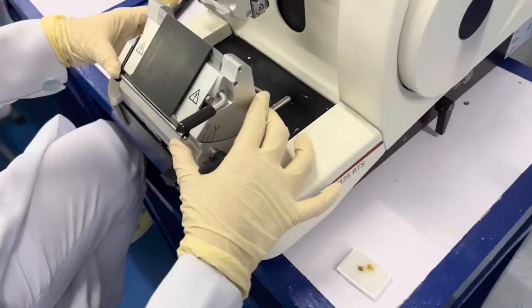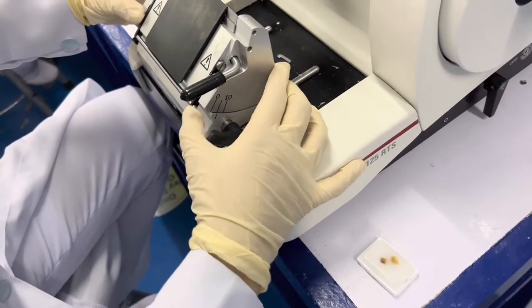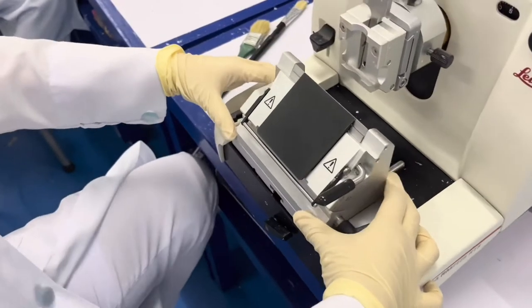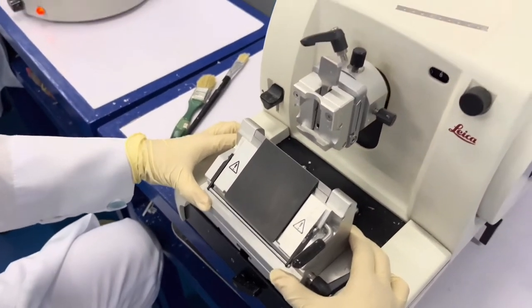Adjust the blade angle holder at 5 degrees. Make sure to lock it by turning the lever away from you. Adjust the blade holder base and position it at the center, and do not forget to lock it.